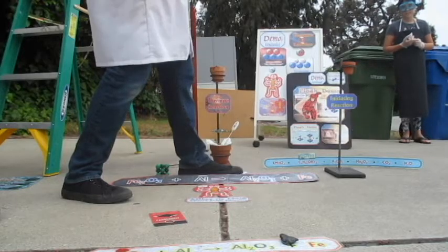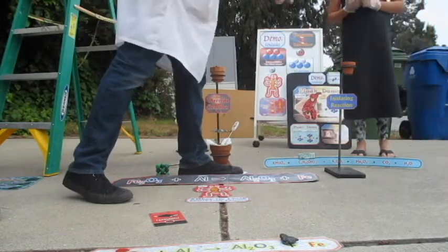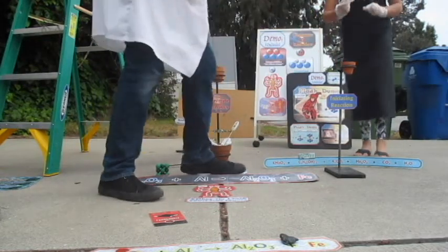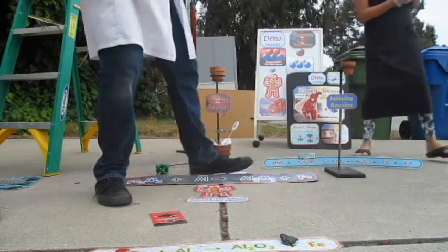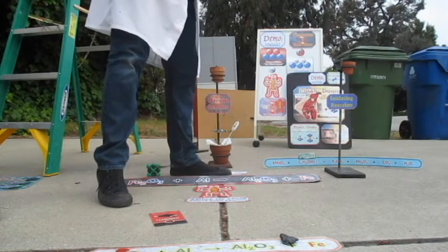So my lovely assistant Lucy, come closer, is going to put glycerin, which is this one, into the potassium permanganate. Go ahead, Lucy. Put it in, put a big dollop. And this should start, okay, that's enough, stop. Yeah, that's good. Now walk away back behind the safety line, thank you. This should start off a pretty flashy reaction.